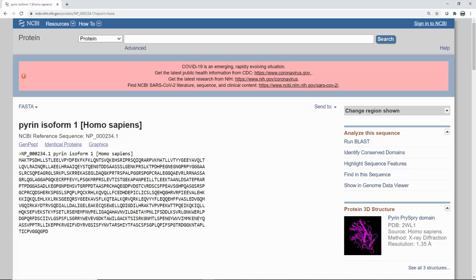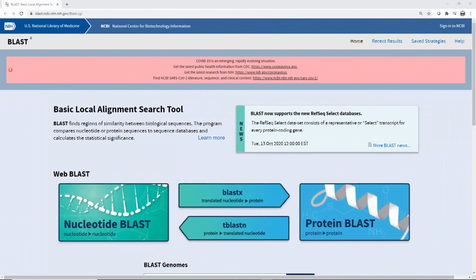We can learn more about the gene from this sequence info. First, let's find genes with similar sequences using another NCBI tool, BLAST, short for Basic Local Alignment Search Tool. The NCBI database has the sequences of a huge number of genes from many different species. BLAST will take a sequence you're interested in, the query, and find genes with similar sequences, or homologs.